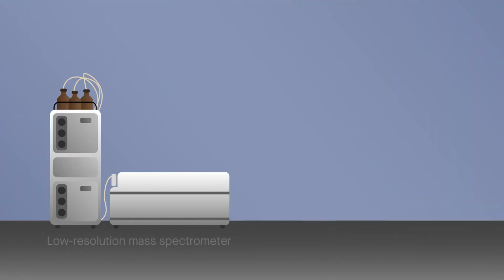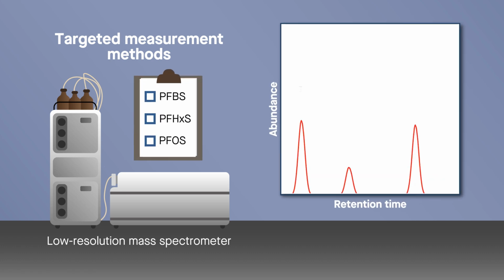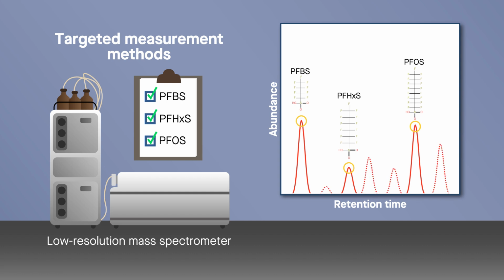Traditionally, chemical measurement data have been generated using targeted analytical methods, which are often based on low-resolution mass spectrometry and always optimized to focus on limited pre-selected analytes. Unfortunately, these targeted methods are largely blinded to all other chemicals that are present in a sample. As such, emerging contaminants may go undetected if EPA relies solely on targeted methods.